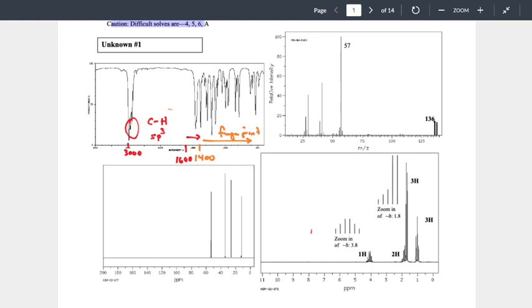Well, if we consider it just the mass of the particle, if I test the mass of the sample, what should I see in my spectrum? I should see a single signal for the mass of my particle. But I see a bunch of other signals. Why are there a bunch of other signals? For instance, I've got this one at 138. I also have this one and this one and this one and all of these. Why do I have all of these extra signals?